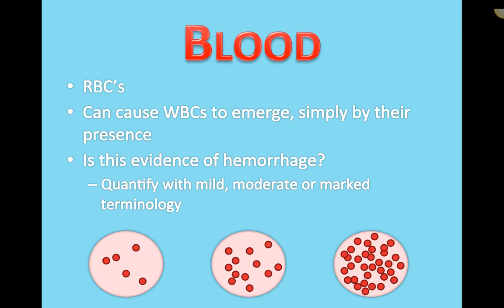Do you have degenerate neutrophils? Do you have lots of neutrophils? Do you have neutrophils and macrophages kicking around? All of those would indicate more toward an inflammatory reaction. Just keep that in mind as you're looking through samples. It does get tricky until you've got a pretty good knack for it, but always look at the entirety of the cells that are present and what they're telling you.